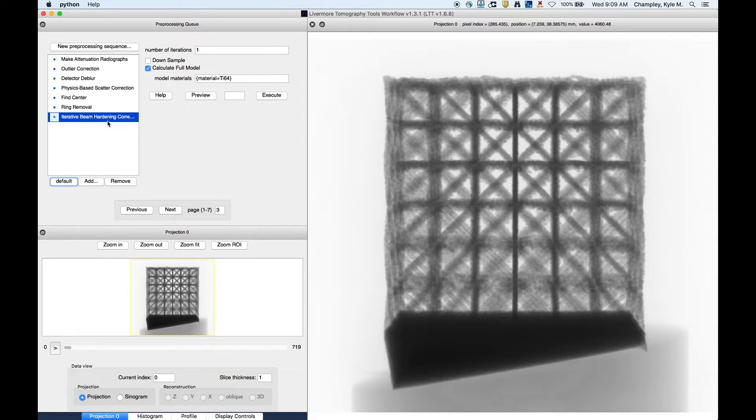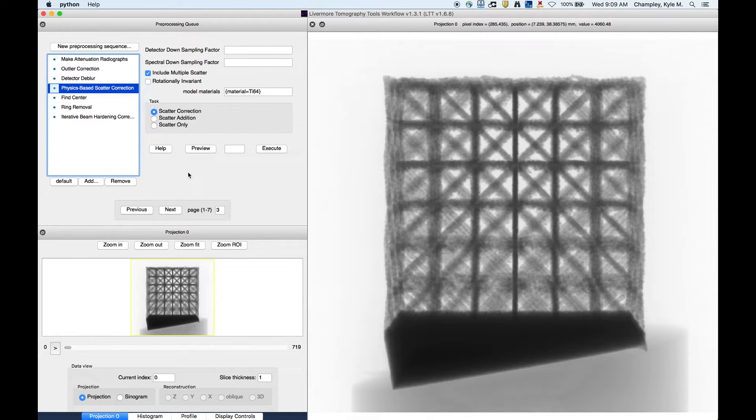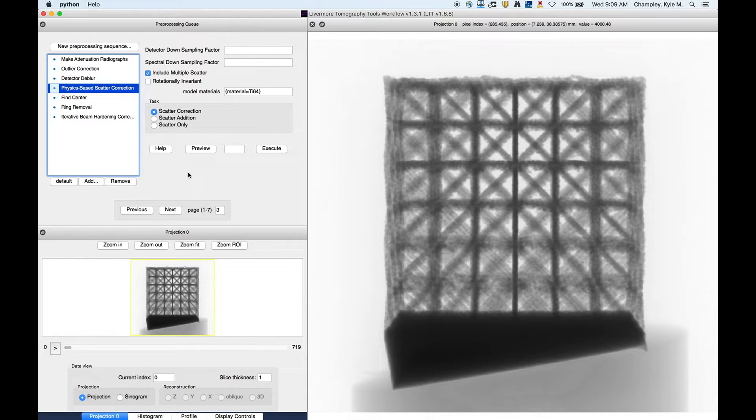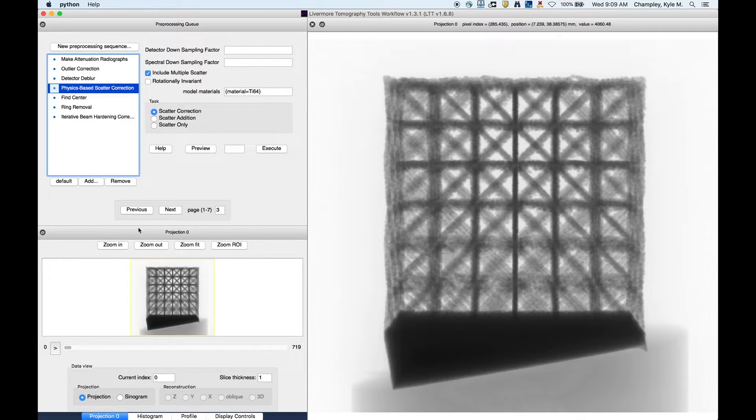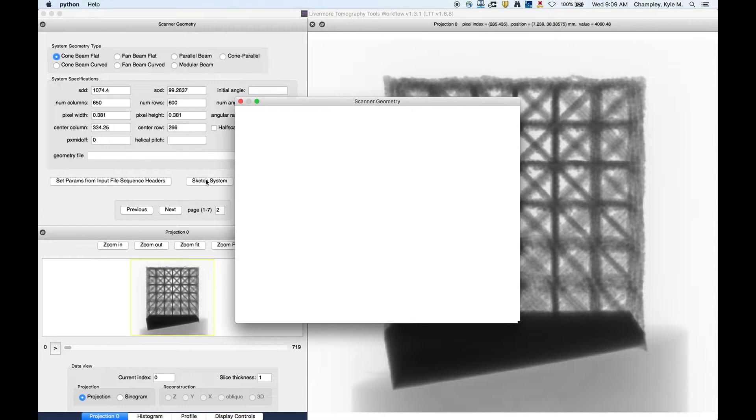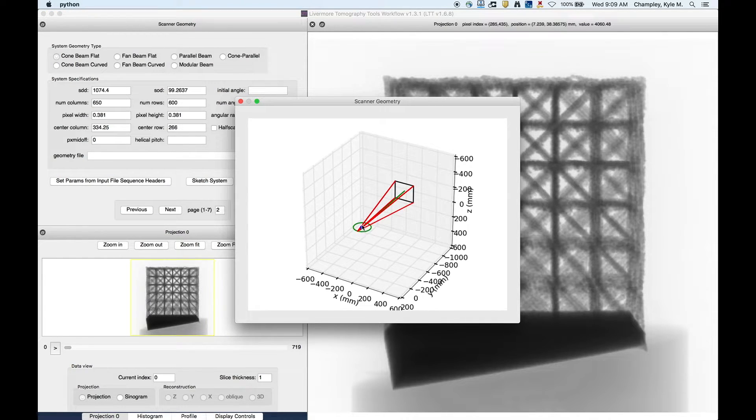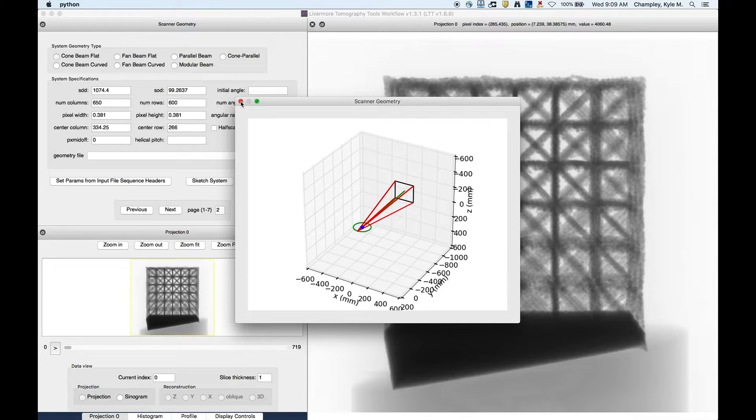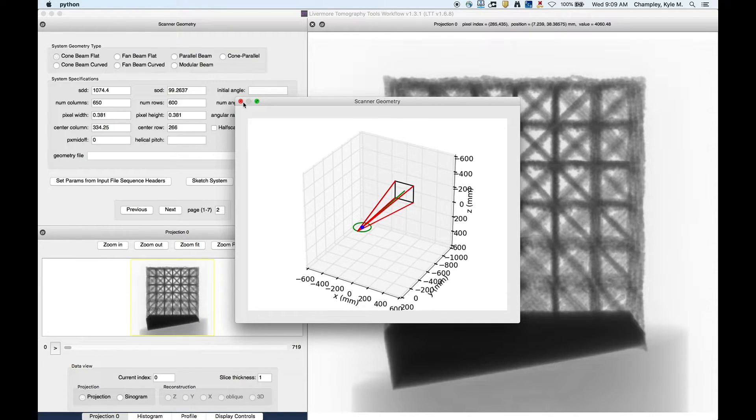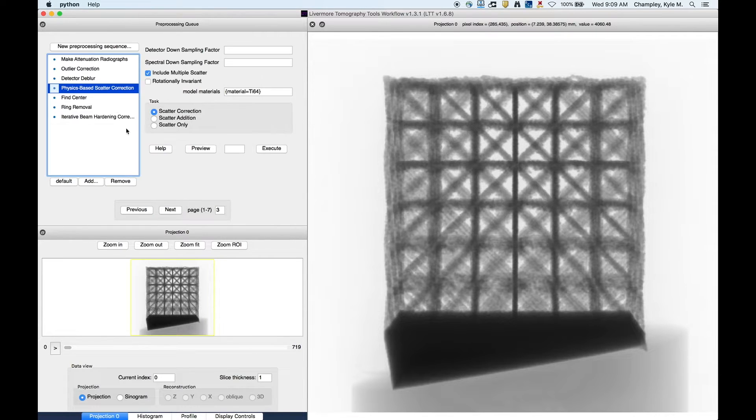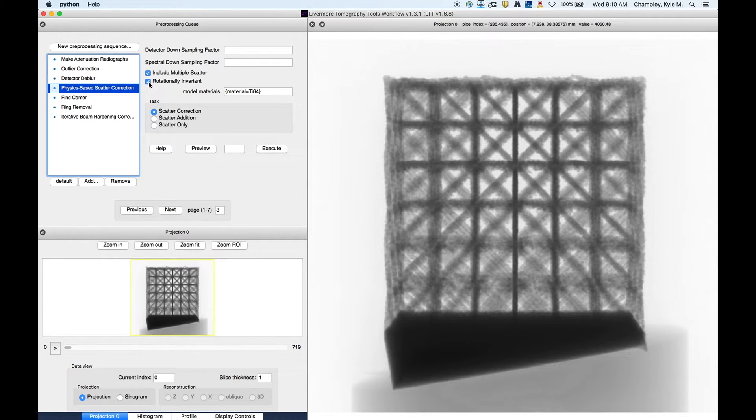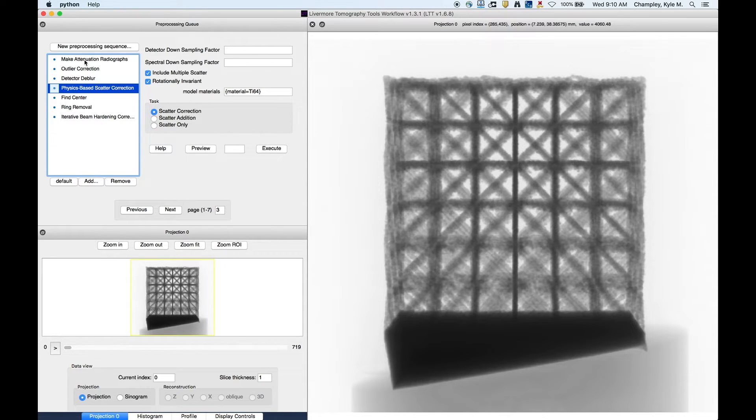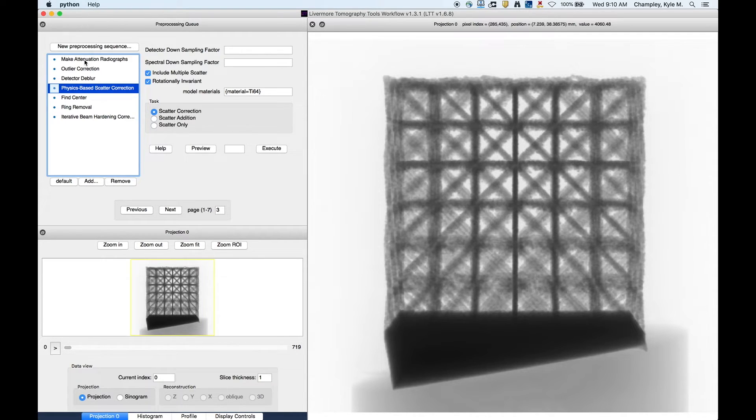Now we're going to make a few modifications here. First, for this one. So the physics-based correction, it's not a terribly fast or a terribly slow algorithm, but this is running on a laptop. So there is a little trick to make this go faster. So this particular scan had a really big magnification factor. So I'll show you. Here's the source, and here's the object, and there's the detector. So it has a really big magnification factor. So the scatter signal is very low frequency. And in addition to that, it's actually the same for all rotations. So to make this go faster, we can just click rotationally invariant. And that'll make it go faster. So that's pretty much the only change that we have to do for this.